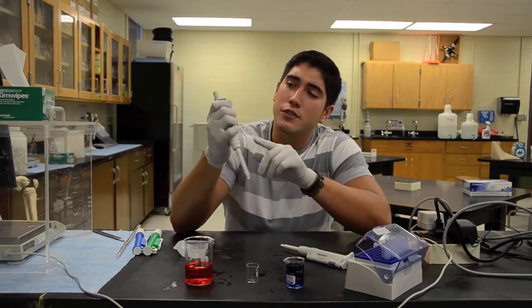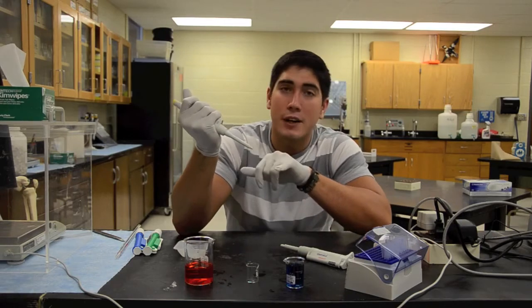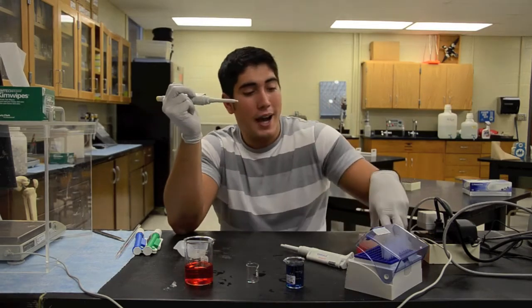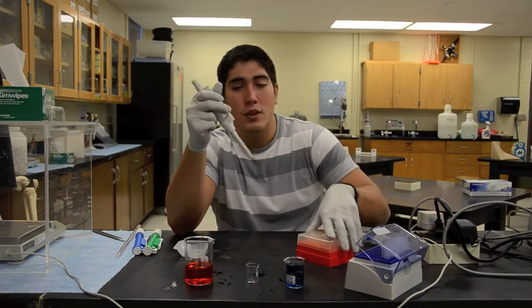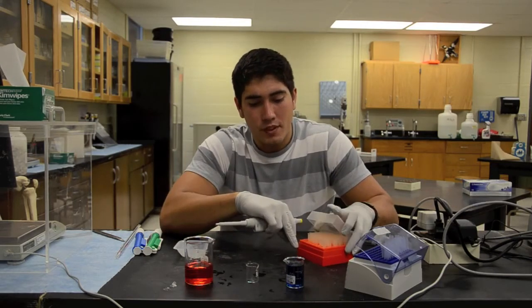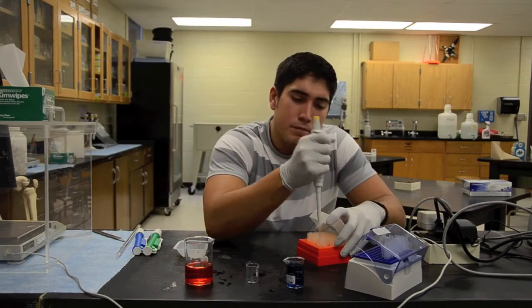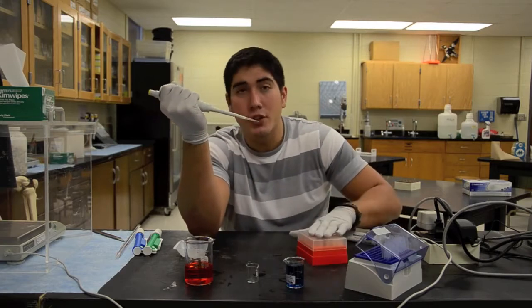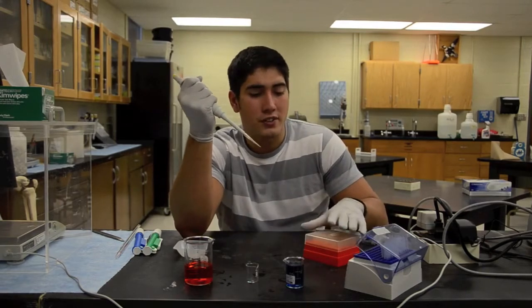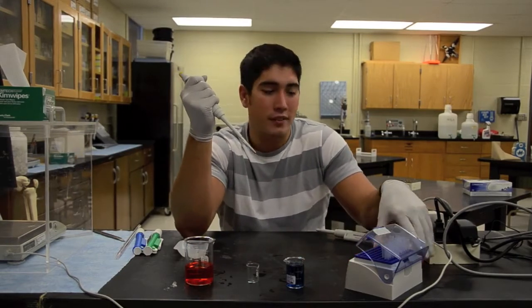As you go down, the front has the ejector button for when you want to eject the micropipette tip, but as you can see we don't have one and we need to change that. So I'm going to add a small tip because this is the 20 to 200 microliter pipette. When getting the tip, you just want to push it firmly in there. It comes out like that. Make sure you close the lid to help keep it sterilized, because you want to do sterile technique with whatever you're doing. We'll show you more steps on how to stay sterile and avoid contamination throughout the video.